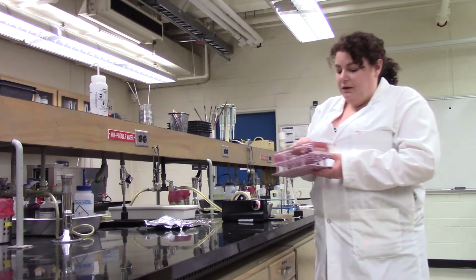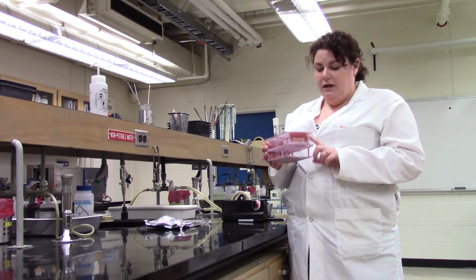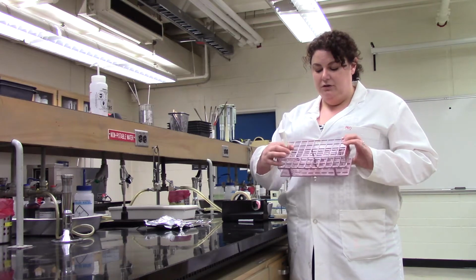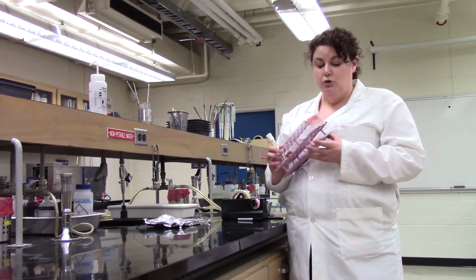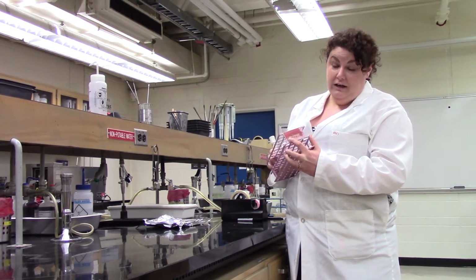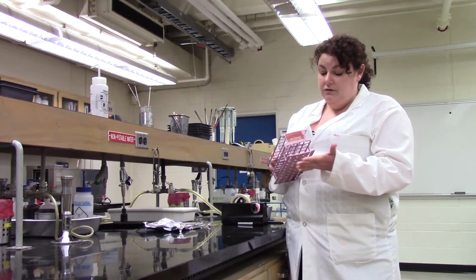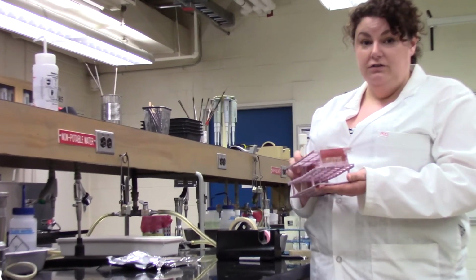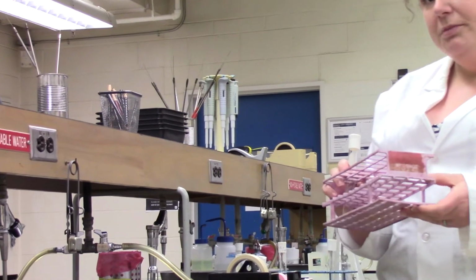We do have a couple of exceptions with the plastics. So we have these colored test tube racks that have square holes for your tubes. And you'll also notice that somewhere on the rack it will say Nalgene on them. So these are safe for the autoclave. These are perfectly fine to use even though they are made out of plastic. It's an autoclavable plastic.